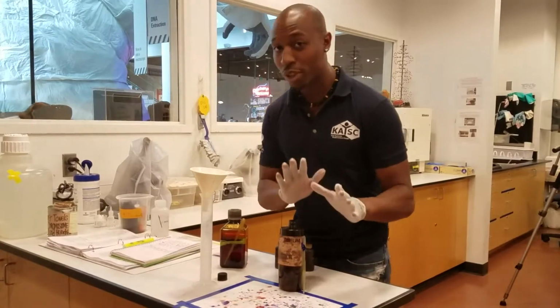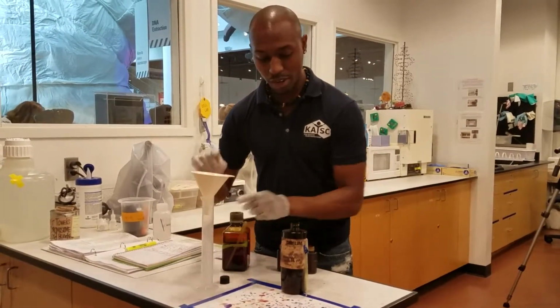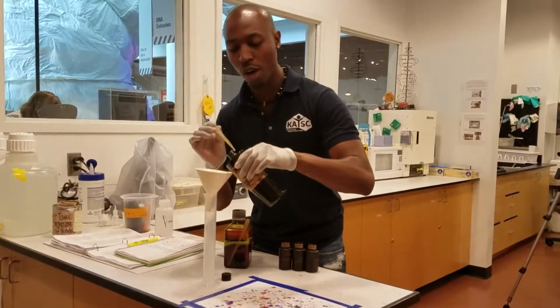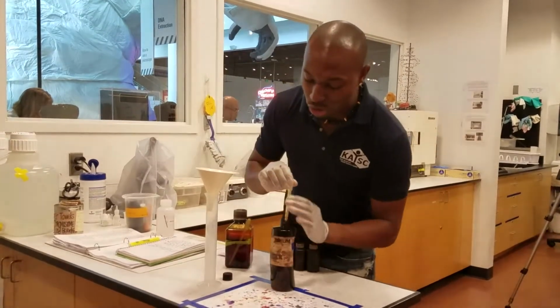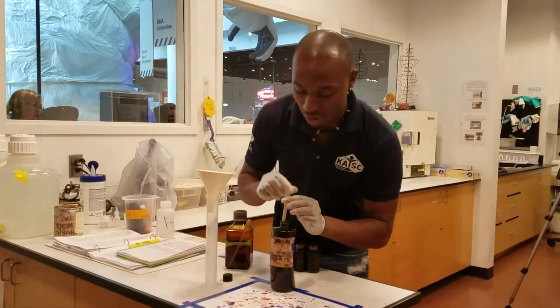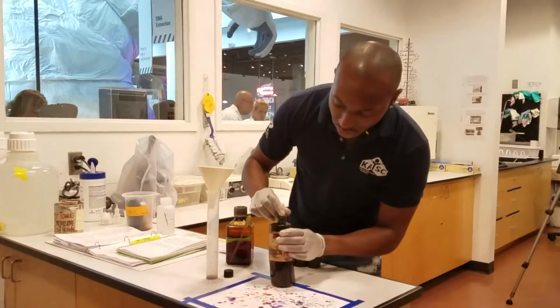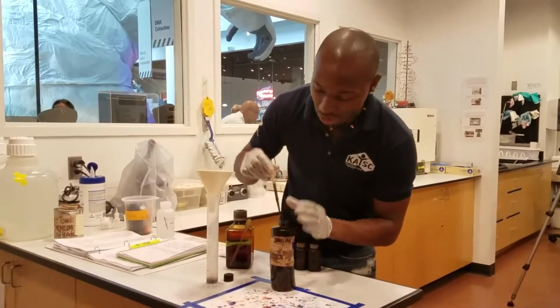Now, there's 2 ways I'm okay for you guys to do this. You can use the cylinder, you can use the funnel, right, and use a pipette and place some in here, or just simply use the whole jug and place some solution into the cylinder. Now what you got to do is stop at 10 milliliters of solution. What I'm going to do is I'm just going to use the pipette, go down until I get to 10 milliliters, because this is a 100 milliliter cylinder.